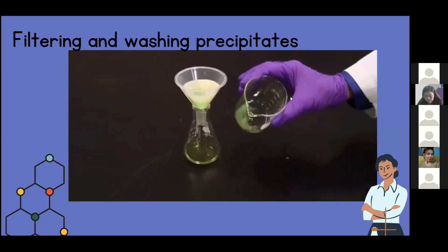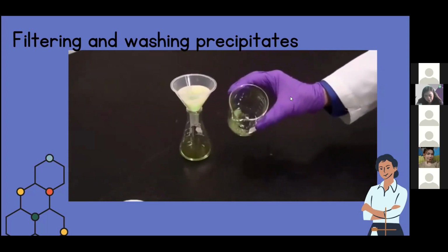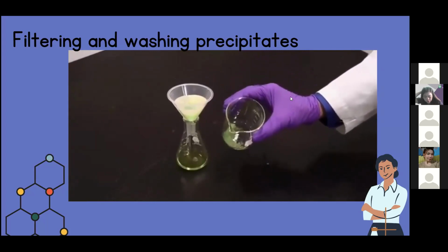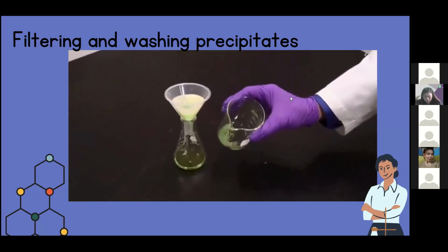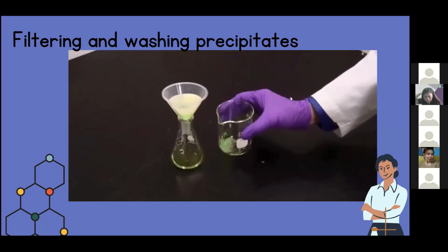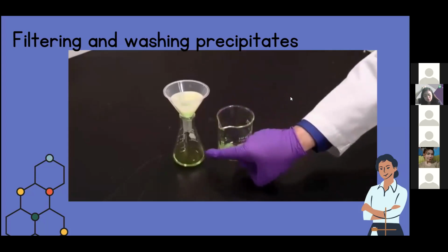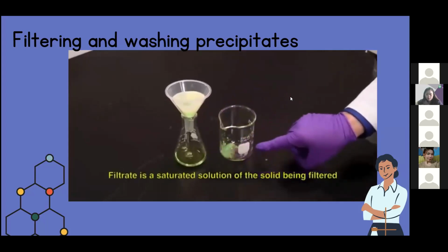Now, you may notice I didn't get all of the solid in the first time. So what I need to do is a second round and transfer it with liquid. The best liquid to use is in fact this one right here, the filtrate.